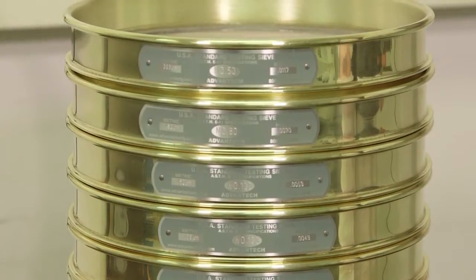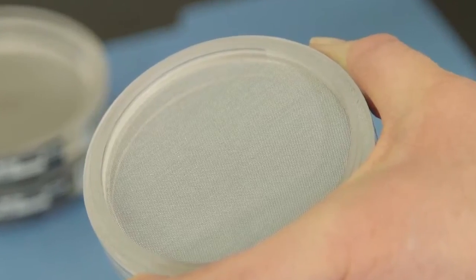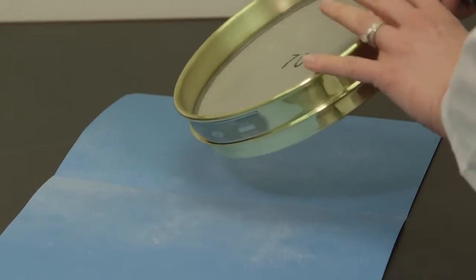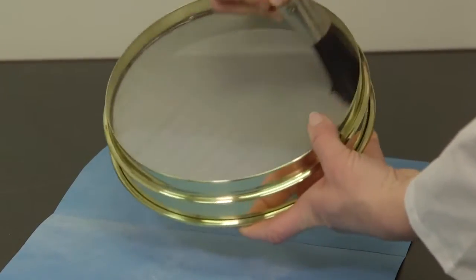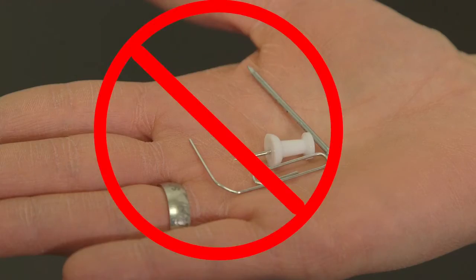Metal frame sieves, for example, will have different guidelines from the 3-inch acrylic L3 sieves and the precision line sieves. To clean your woven wire cloth metal frame test sieve, start by gently brushing from the bottom side only. To avoid distorting the apertures, never use a sharp object to clear a blockage.